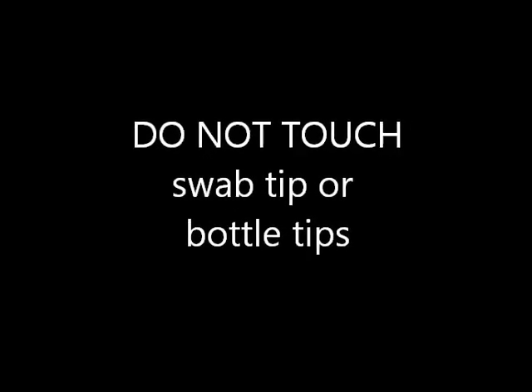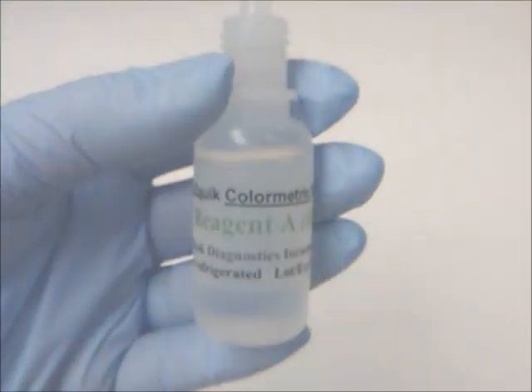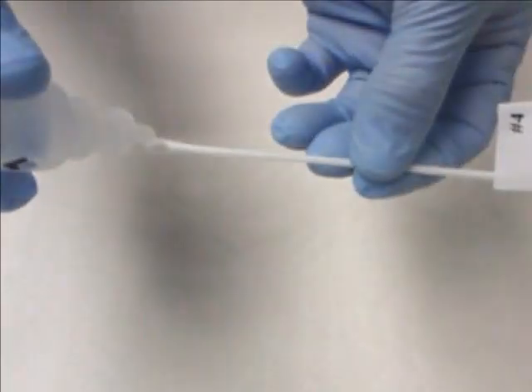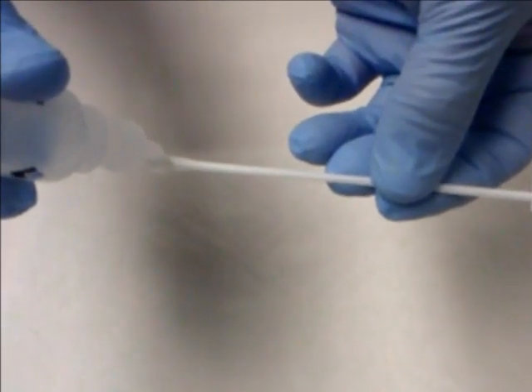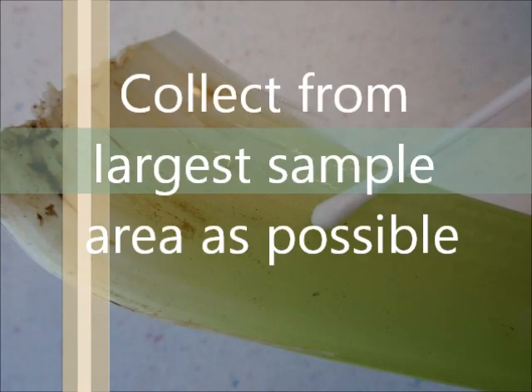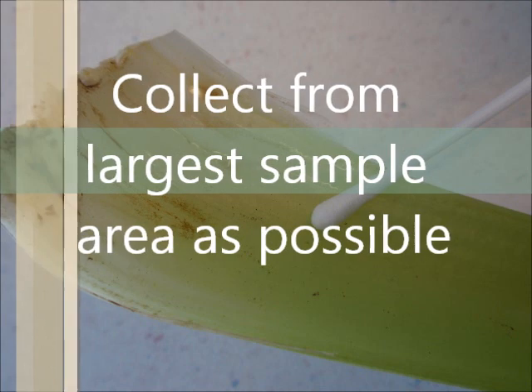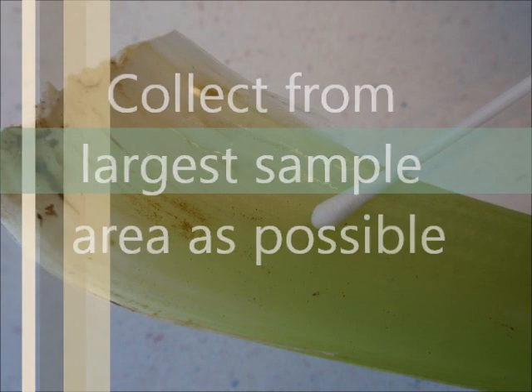Be sure not to touch the swab tip or any of the bottled tips to avoid cross-contamination. Take one swab and add two drops of reagent A, which is a wetting agent, to the tip of the swab. Rub the swab tip over the surface to be tested, rotating the swab to pick up as much material on all surfaces of the swab tip. Try to rub a test area the size of half a sheet of paper, or if the area is smaller, such as a cutting blade or food item, then collect a sample area as large as possible.